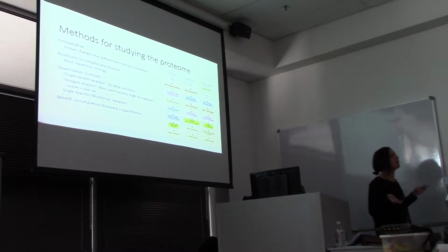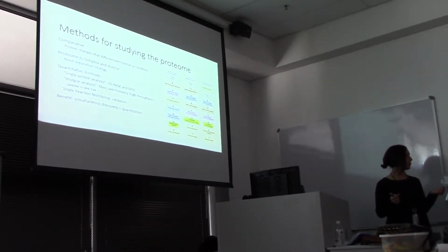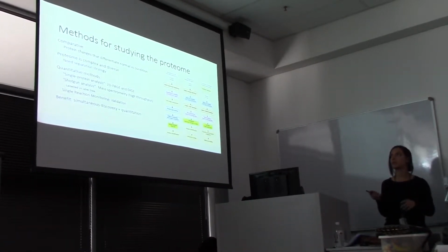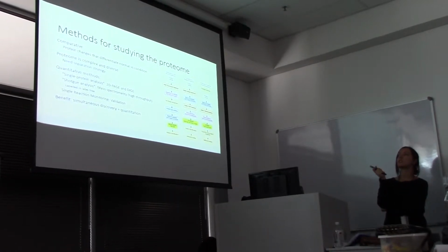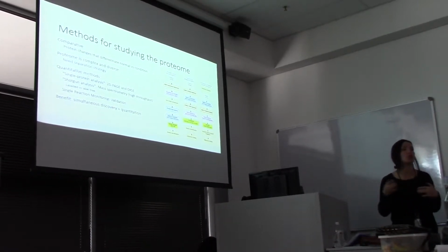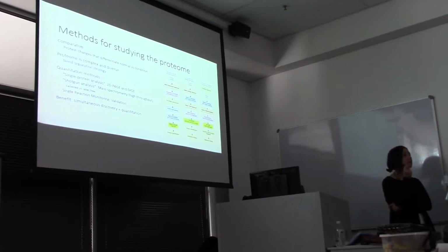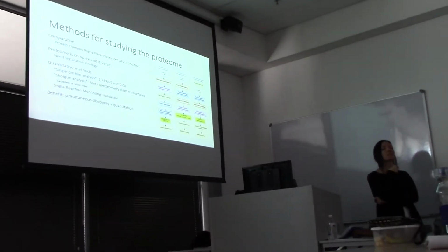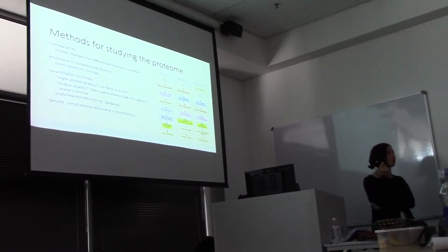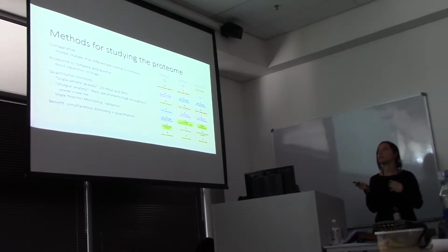So there's a number of methods that you can use, and I'm really focusing here on comparative proteomics, right? Like a disease state versus undiseased, or stress versus non-stressed, or acid stress, something like that. So you're looking at proteomic changes that differentiate your normal state versus your condition, and that could be anything, right? And the proteome is very complex and it's very diverse. There are thousands and thousands of proteins in your sample. So usually you need some sort of separation strategy to try and tease out what you're seeing on the MS. And we'll talk about how to separate these proteins.